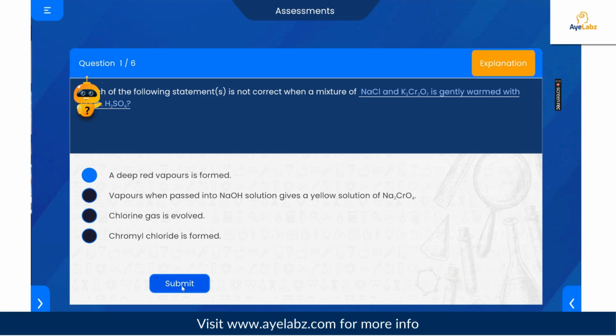Also, upon answering each question, it will give you an immediate response whether it is right or not. You can use the assessment feature as a way to gauge students' comprehension. The way that they can go back to the experiments and double check their understanding makes it a fantastic tool for reinforcing key concepts without the pressure of getting it right the first time.